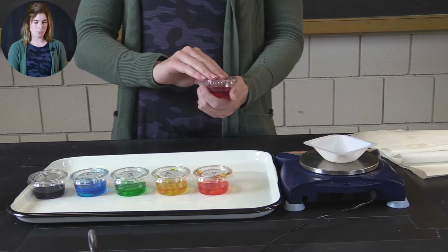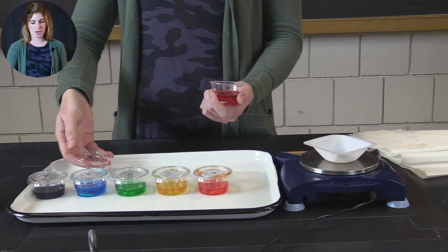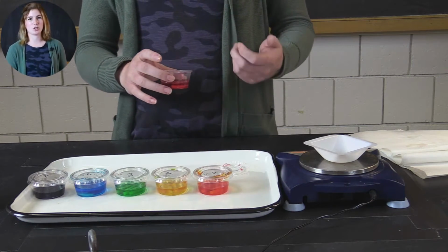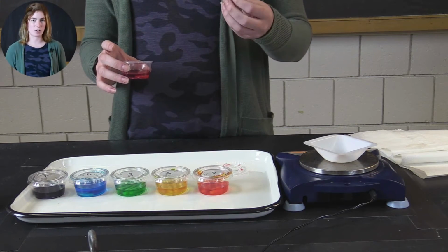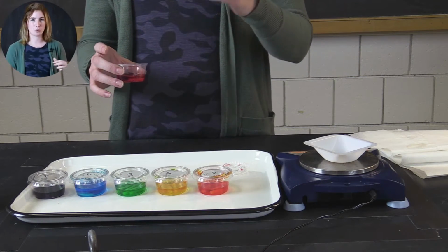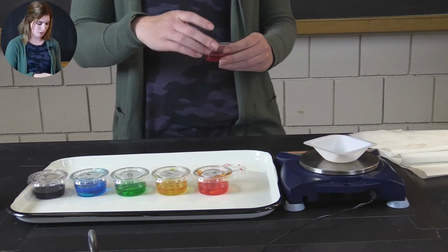So I'm going to take my red ones out. If you look at your procedure, it says to blot the potatoes dry a little bit. The reason we're going to do that is we don't want them soaking in extra water, because this will make the mass higher than what it really is. We just want to know, did my actual potatoes themselves gain mass, lose mass, or maybe stay exactly the same. So I'm going to take these out.